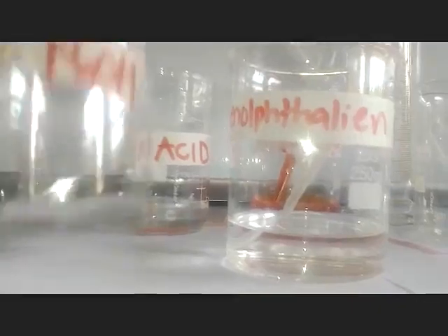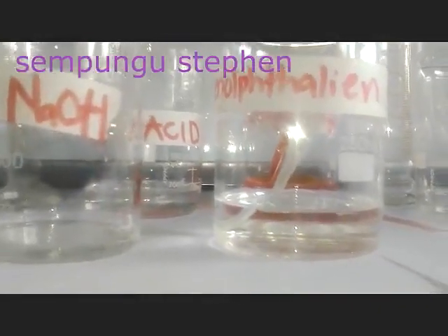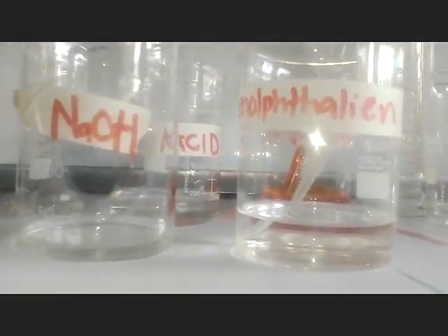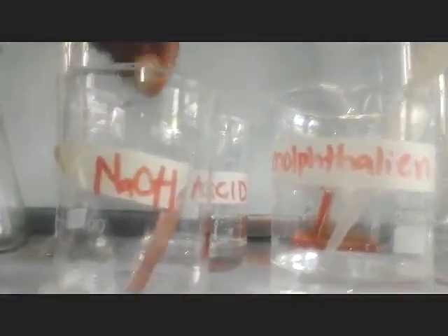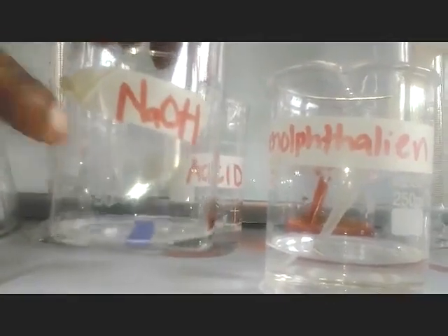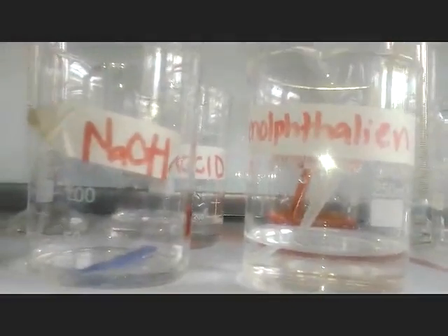Now let us see if I get a base. I have my base here as sodium hydroxide. What proves that it is a base is using the red litmus paper. This is red litmus paper. I get one paper from it, red as you are seeing it, and I put it in my solution there. My paper is turning blue, as you are seeing. Let me get a small piece like that to show you clearly, and then I dip it there. You can see that when I dip it, it is turning blue.